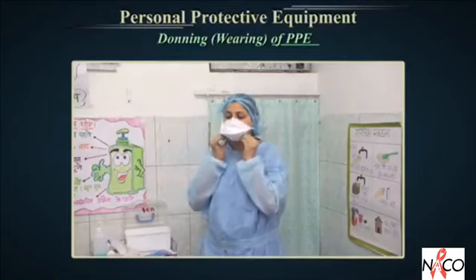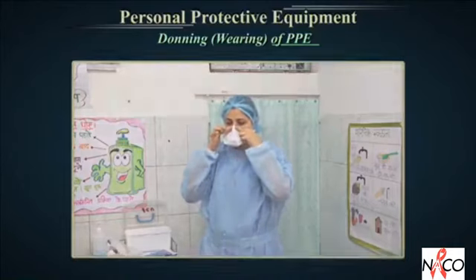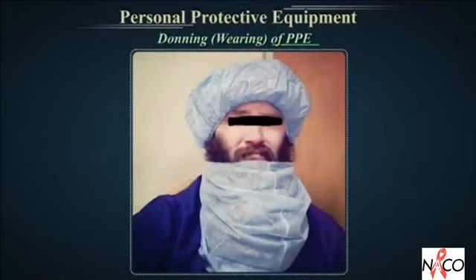Finally, breathe deeply to feel any area where air is escaping out along the edges. Facial hair interrupts the seal, and even a small amount of stubble may compromise the protection from pathogens.